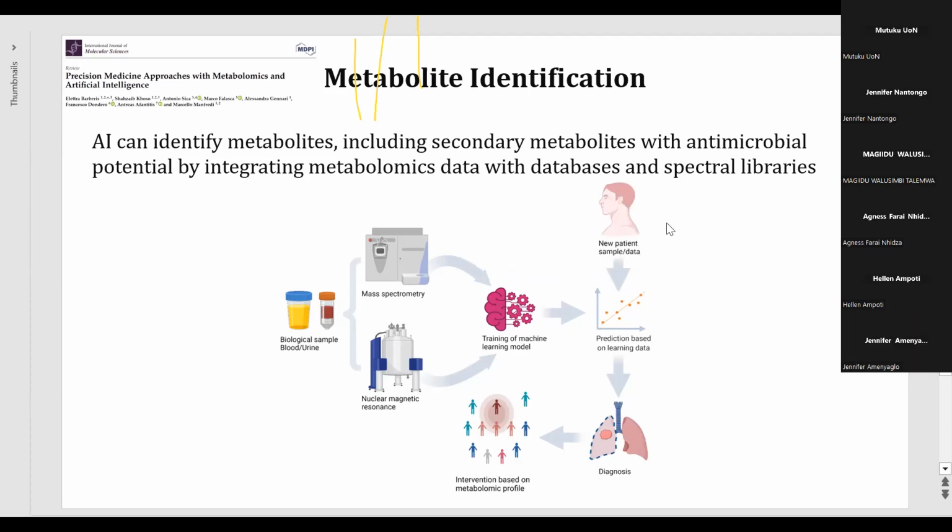This is the new, and then this is the in vivo study, which is this person's urine sample or blood sample. And then you see whether this metabolite is acting on the liver or the lung, how is it acting? Or how is his lung functioning, and what is the difference in function? So this is a total population of human beings, and then you can see that this person is acting differently or his metabolites are different based on the artificial intelligence. You can do that.